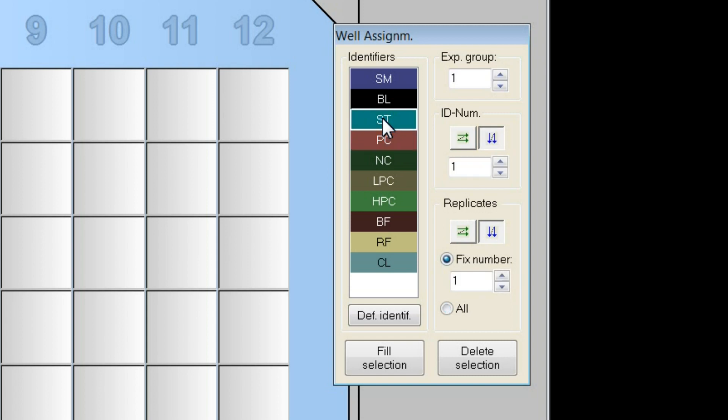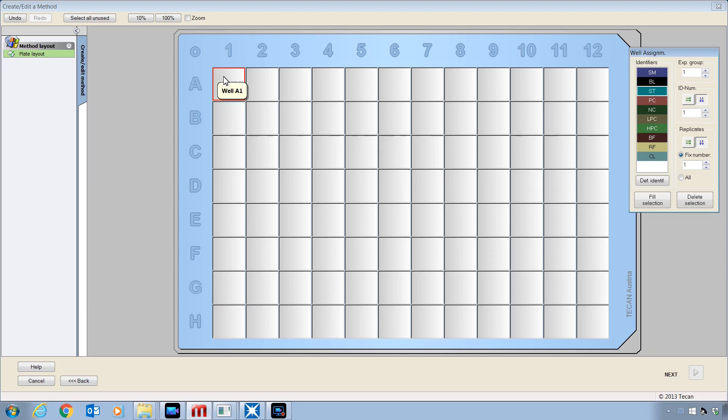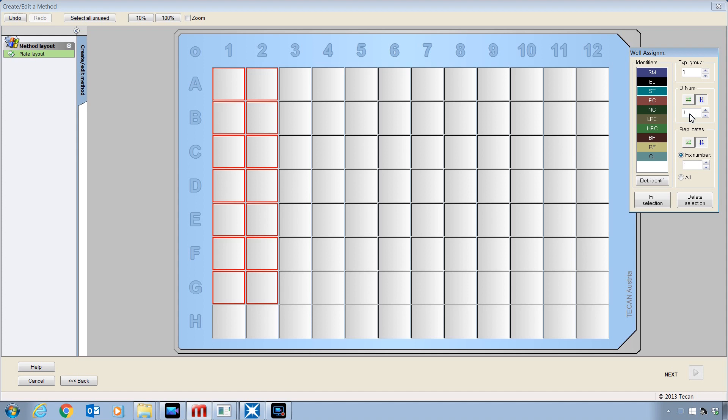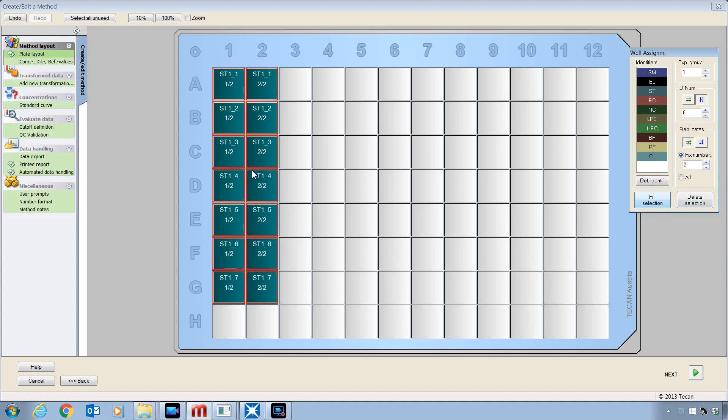The ST standard identifier is always used on samples where you want to plot the results on a curve. So let's start by clicking and dragging to select wells in these two columns so we can place some standards that will be used to plot our standard curve. In the well assignment toolbar, I want to use ST and start with ID number 1. Selecting this button here will cause the ID number of the standards to fill and increase in a vertical direction. For replication, I have selected two replicates to fill in a horizontal direction. By selecting fill, we can see the standards defined with 1-7 and replicates arrayed horizontally.